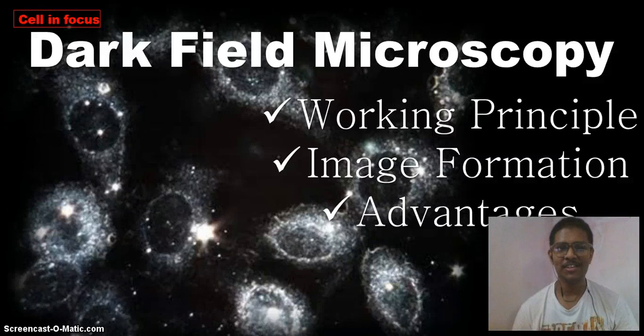Hi there, this is Shaun, and this video is about dark field microscopy, which is another important technique in the microscopic field. This video is part of the sequence Cell in Focus, where we are discussing different types of microscopic techniques.